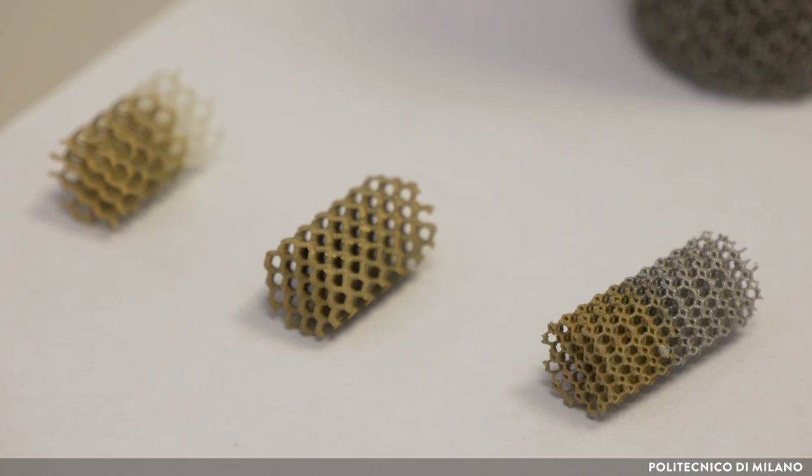Finally, the sample is dried with a flash drying at 320 degrees C for 5 minutes in order to obtain the final coating. In some cases, a calcination step is necessary to obtain the final sample.